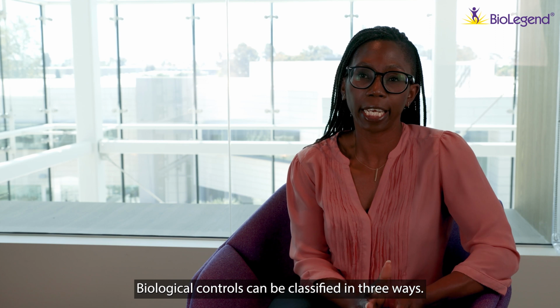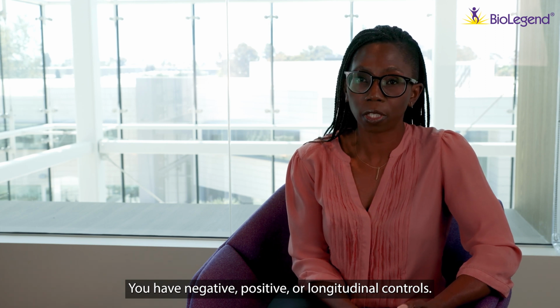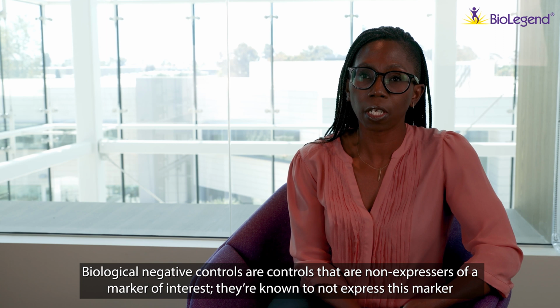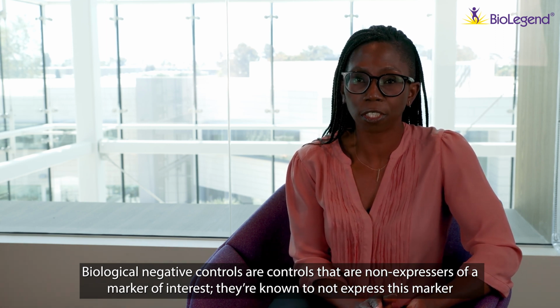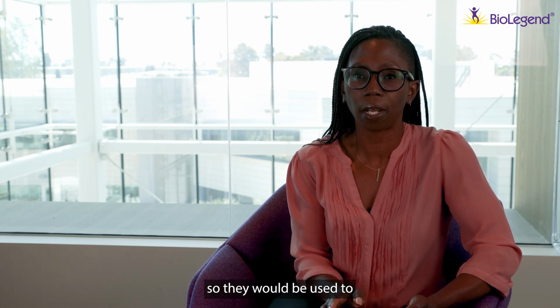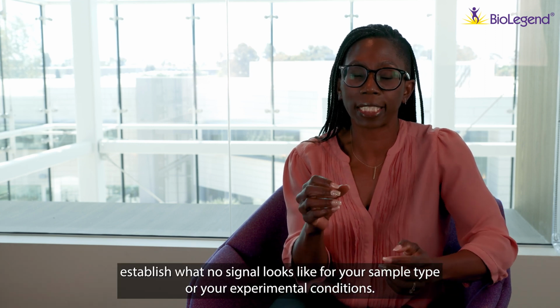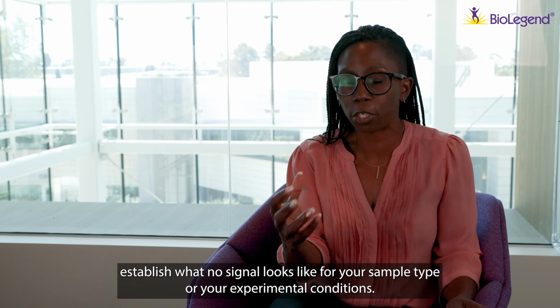Biological controls can be classified in three ways. You have your negative, positive, or longitudinal controls. Biological negative controls are controls that are non-expressors of a marker of interest. They're known to not express this marker. So they would be used to establish what no signal looks like for your sample type or your experimental conditions.